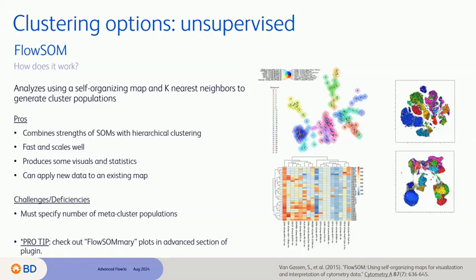If that's fine, then I would check, where are you saving the data? Make sure there's not any problems with FlowJo being able to read, write information, or R for that matter, to read, write data to certain locations, right? If it's on a server or something like that, try locally or try to save as a FlowJo archive, run it from the archive, see if that works. That might inform you, if it does work from an archive, that maybe there's some kind of permission issue with where your workspace is saved, if it's on a server, for example.